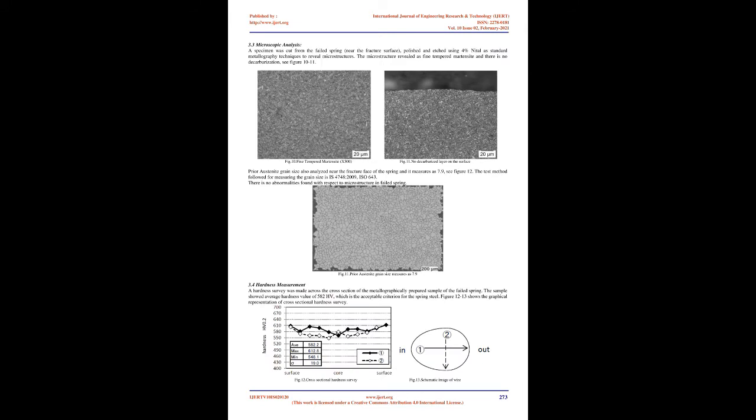About 117 µm beneath the spring surface, a non-metallic inclusion, which was carried from the base steel, was observed. The non-metallic inclusion measured 26.1 µm x 3.58 µm, and EDAX analysis confirms the presence of a silicate-type non-metallic inclusion. Refer to figures 7-9.